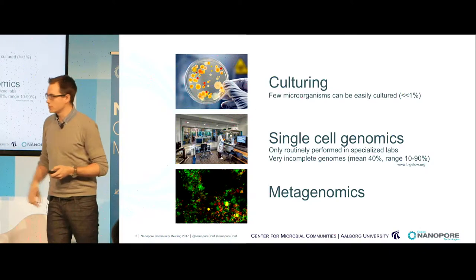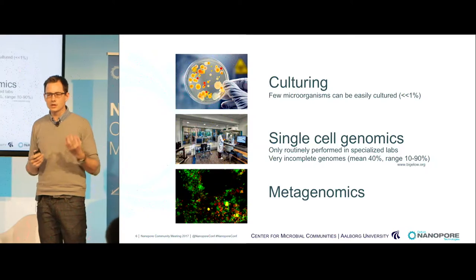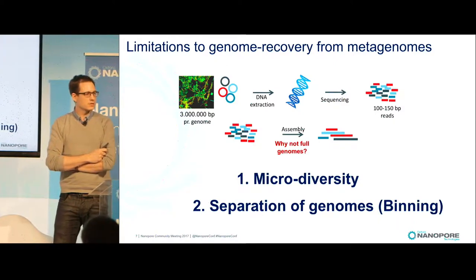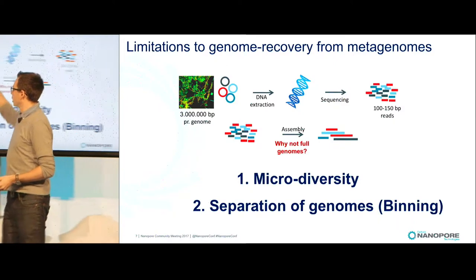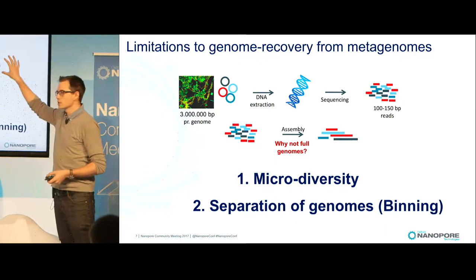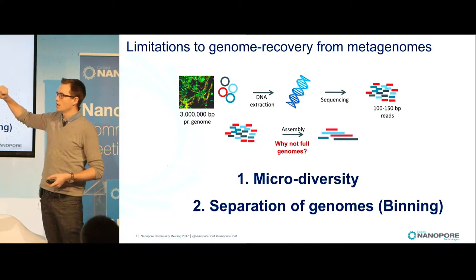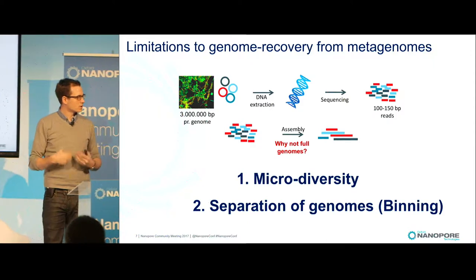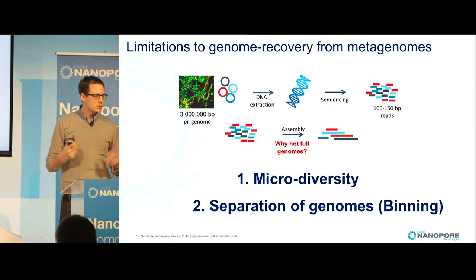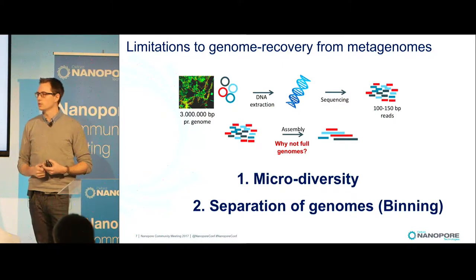So what a lot of people have been doing for some years now is starting to use metagenomics instead, trying to simply sequence everything and reconstruct genomes from there. And in principle, it's actually relatively simple. We take a complex community with many bacteria, extract all the DNA, and sequence it. We used to do it with Illumina sequencing, just sequencing a lot of data. Before, the limiting factor has really been that we didn't sequence deep enough. But now we can sequence deep enough that we, at least in theory, have enough data to start to assemble all the genomes down there.